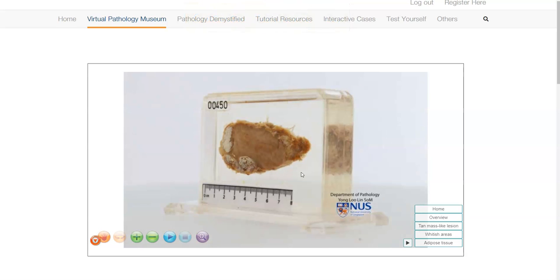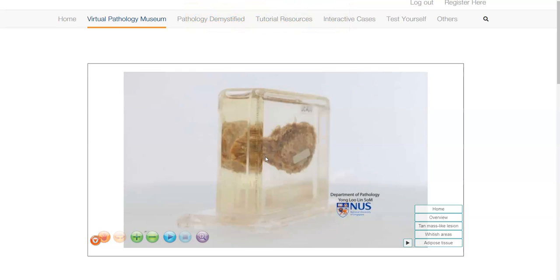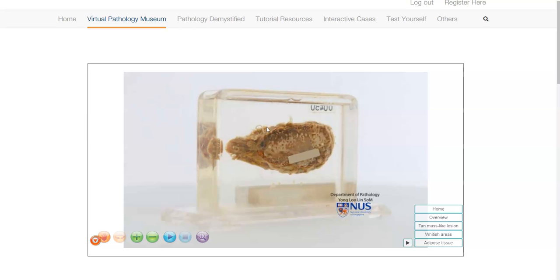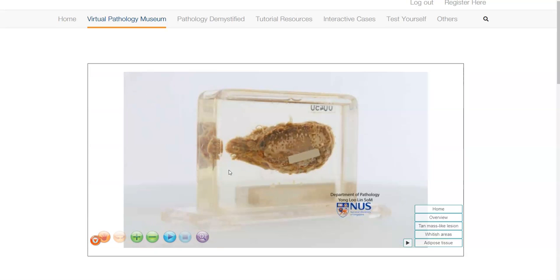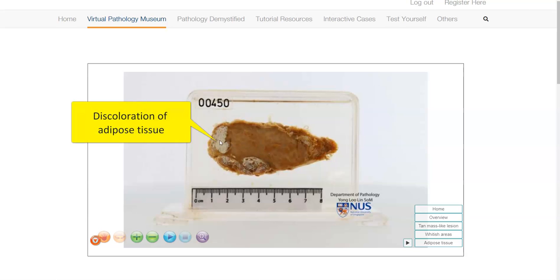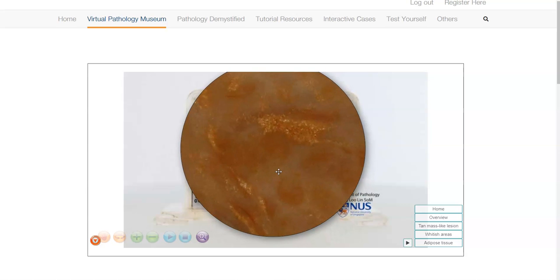Let me turn this around. Here we can see that it is relatively well-circumscribed, and here again is the cut surface. The reason for this discolouration is because there is some degradation of the fatty tissue. Let's take a closer look at the cut surface.